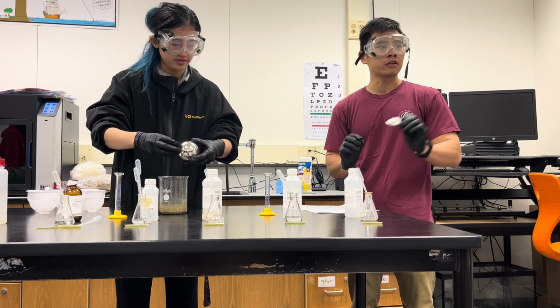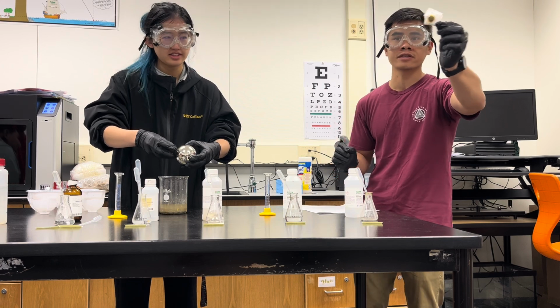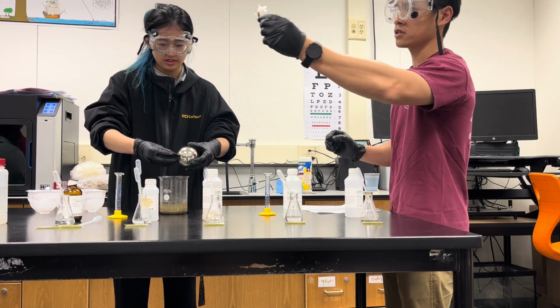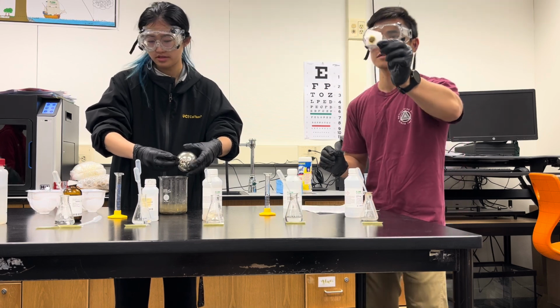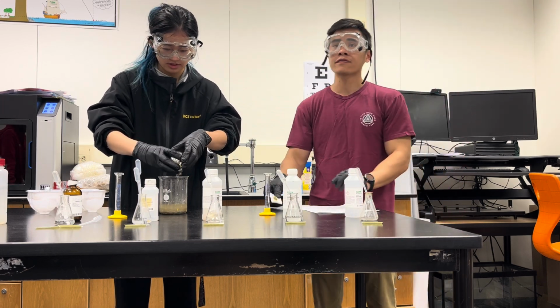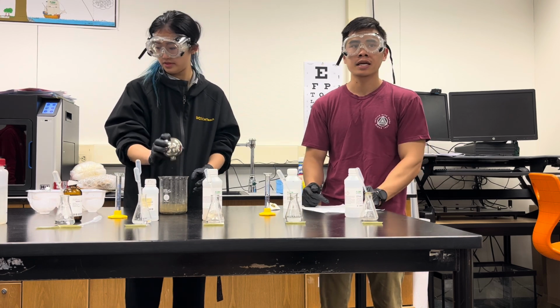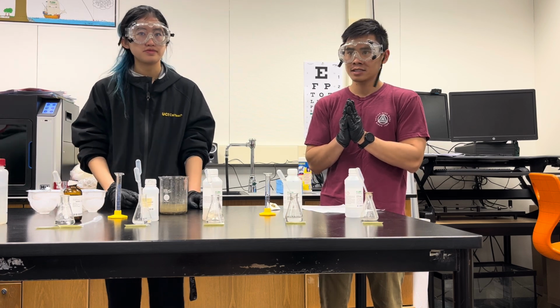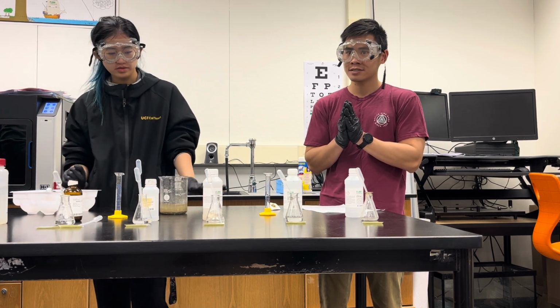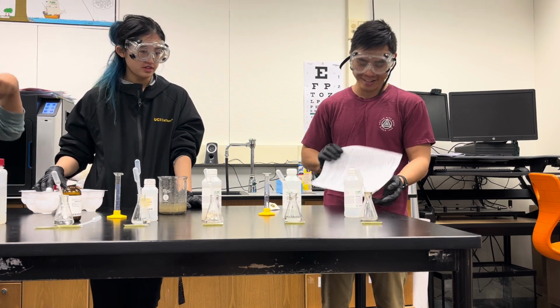While it's coating, if you like your clothes, this is the color that it would turn if we're not careful with it. So you want to look at the color. All right, after we swirl, we dump and we dry. And that's it. Any questions? Nah, that's cool. That's a lot of steps though. It is a lot of steps. Okay.